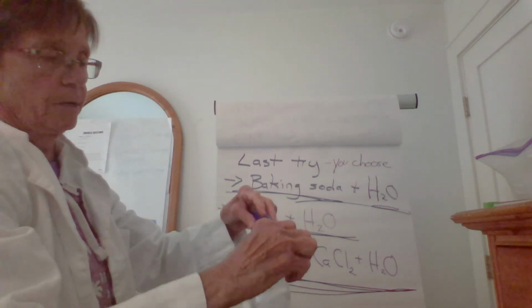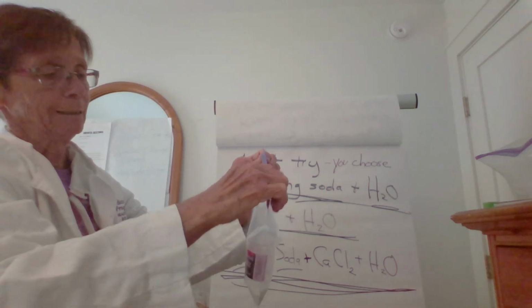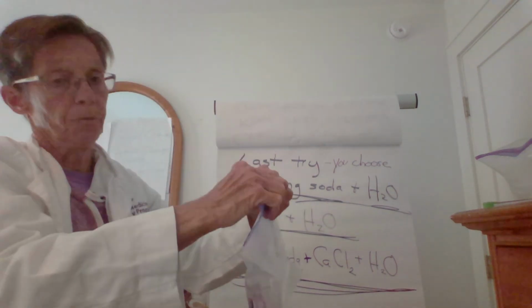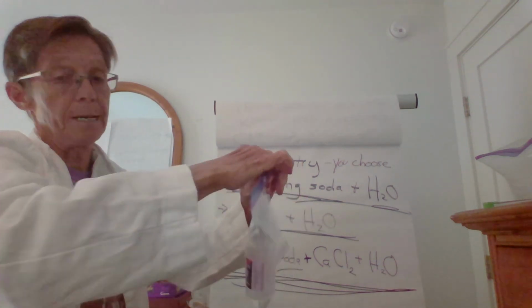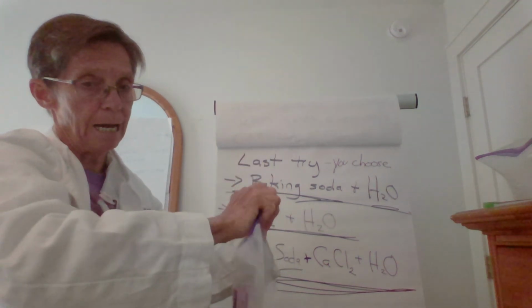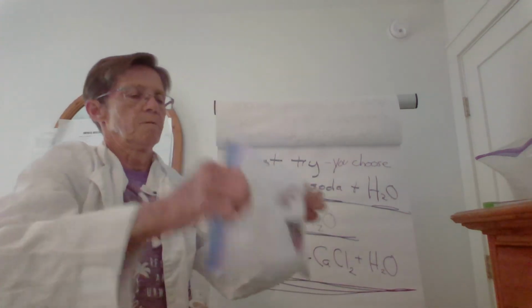Now, we got cold and we got hot. And remember, we're seeing, do we have a chemical reaction? And what actually is the combo that makes the chemical reaction? And what is the purpose of phenol red? So we've got lots of questions here. All right, take round and roll. Whoa.